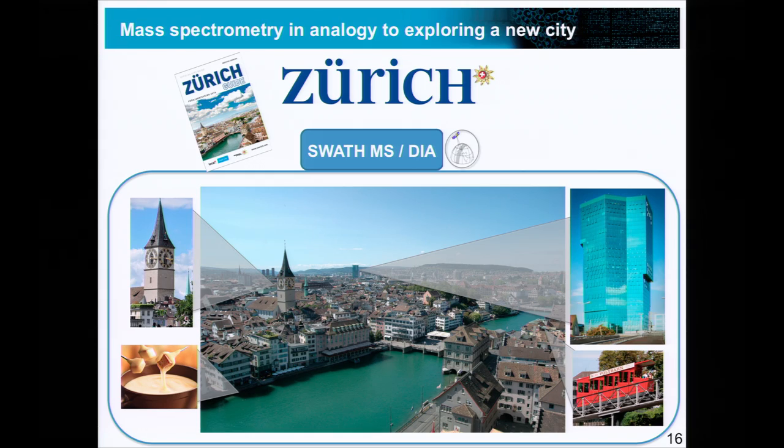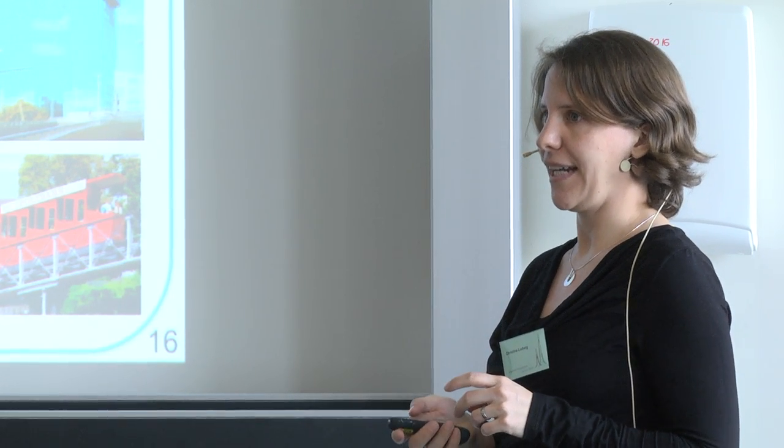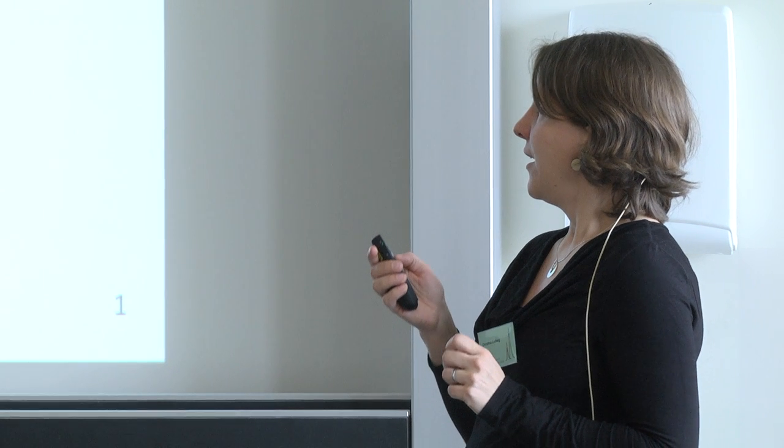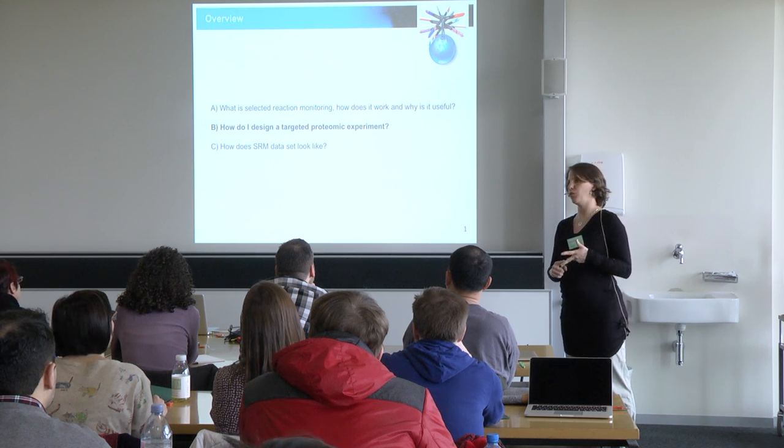Not everything is 100% comparable to mass spectrometry, but it's a very easy way to understand the different approaches of these three different technologies. Are there any more questions to this first part? What is SRM? How does it work? And why is it something useful to do?